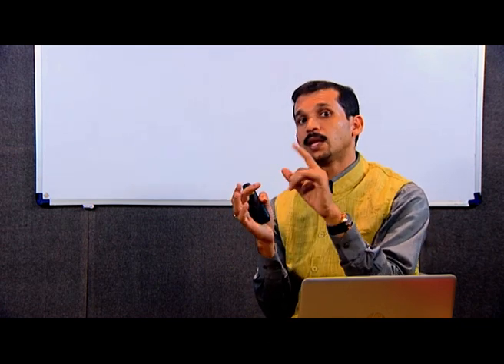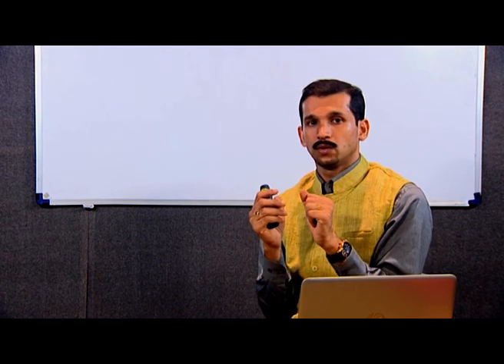First and foremost, the signal. Signal is what we need for a sensible estimation of what the XRD is about. So, the signal is the most important part. And second is the background. You cannot avoid a background because there are many contributions. There are many constituents which can contribute to a background. For example, if your sample is hygroscopic, or a water absorbing sample, the water itself will be an amorphous contribution in your sample, and that can lead to a big background.